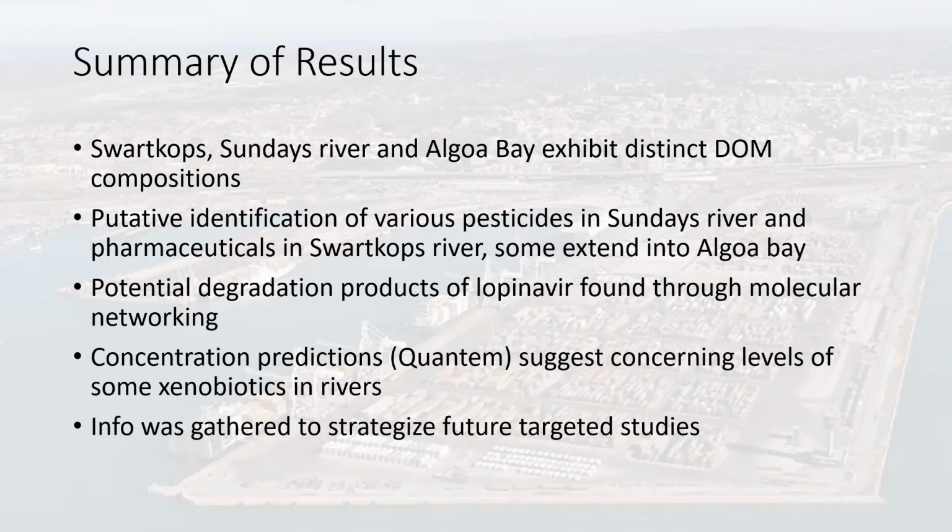Like even mass spectrometry studies, but they were always targeted studies, where someone would go with a set of known antibiotics and just quantify those. And now, using this data for any future endeavors, we basically have a repository of what compounds we can detect using this approach. If we want to quantify, we already know which authentic standards we need to buy that might give us interesting results or that are worth studying.